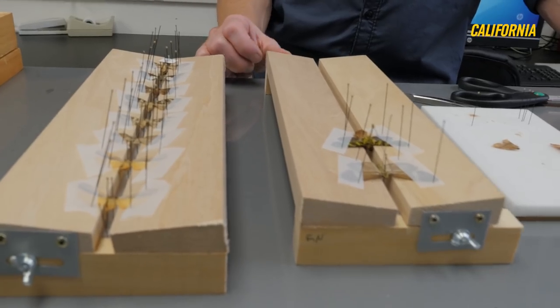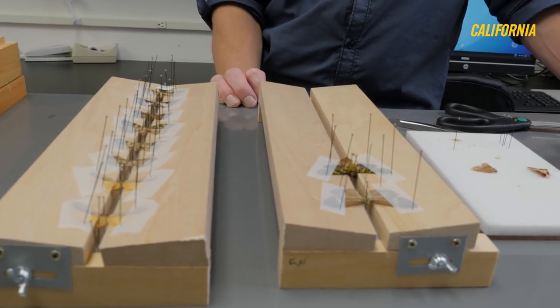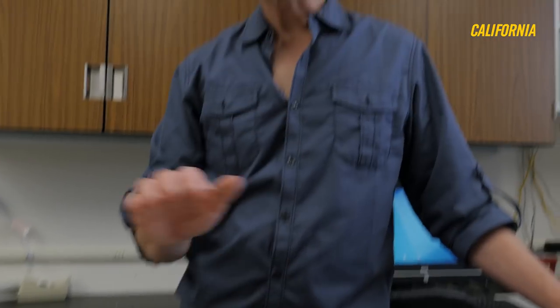Once the specimens are dry, we'll take them off the board. Here are some that have been on the board a little longer — we'll add the labels to them and then they go into the collection. They are not safe from bugs while sitting on these boards, which is why I like to have them there for a minimum amount of time. Once I take them off the board and they go into the drawer, the drawer then goes to the freezer and stays in there for three days, just to make sure nothing got picked up while they were sitting out.